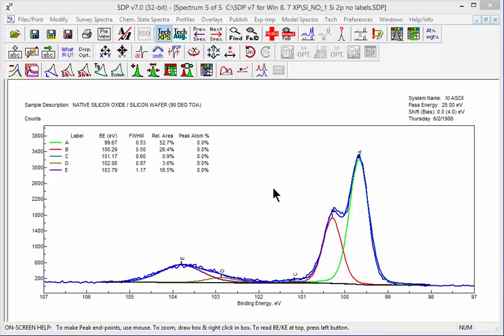This is session number 17, the second part of desktop publishing. Here we have a high-res spectrum, or a chemical state spectrum. This is a native oxide of silicon. We have elemental silicon here, these two peaks, 2p3, 2p1. This is the Si2O species. If SiO was there, it'd be here, and this is Si2O3, and this is SiO2.